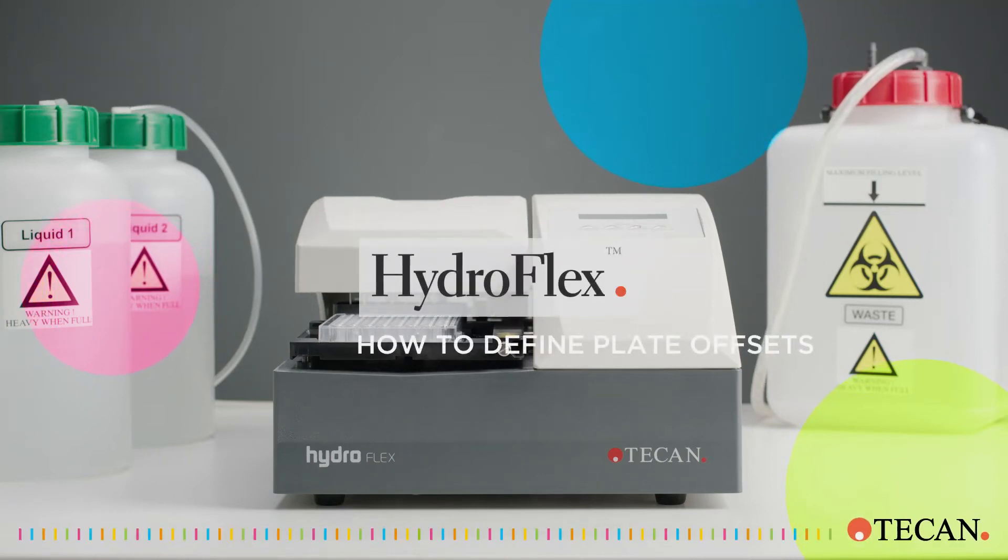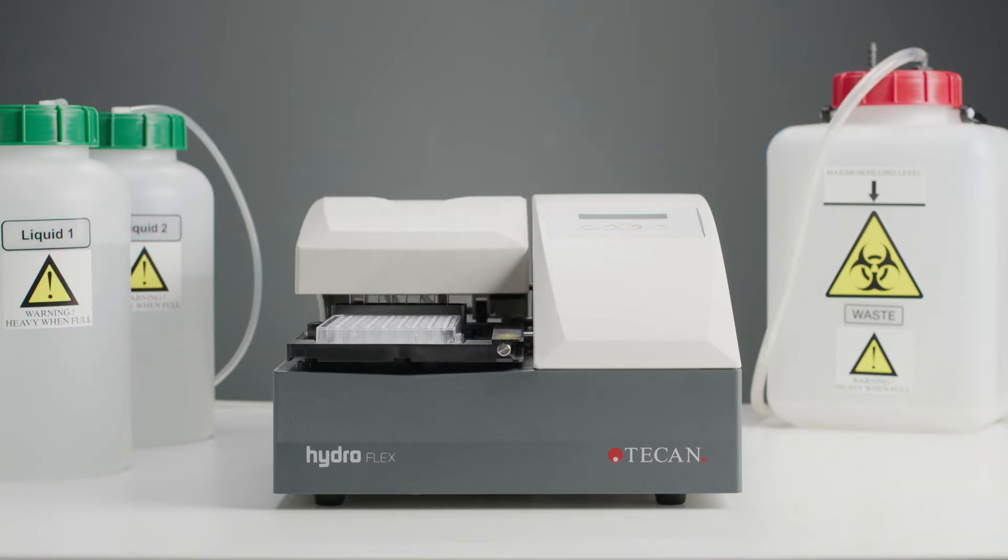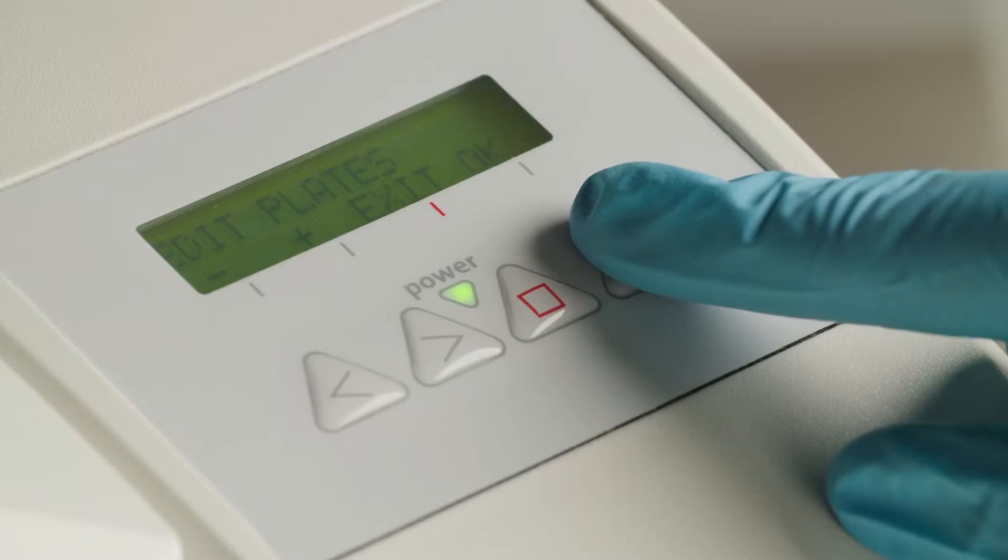Hi and welcome to this video tutorial on how to optimize plate offsets for the HydroFlex microplate washer using the locally stored predefined plate library.